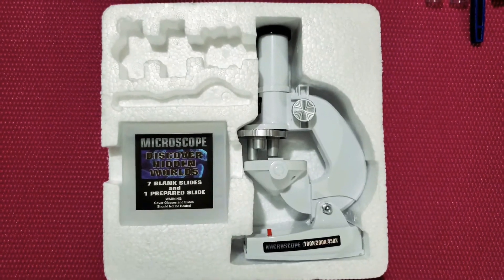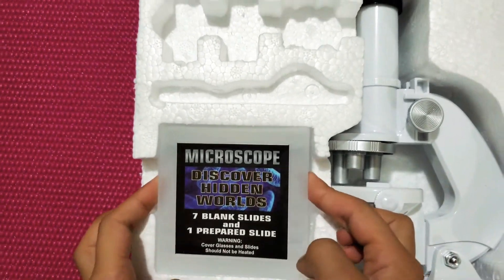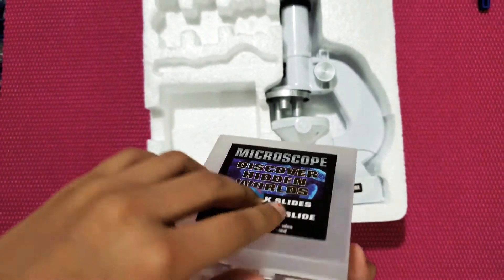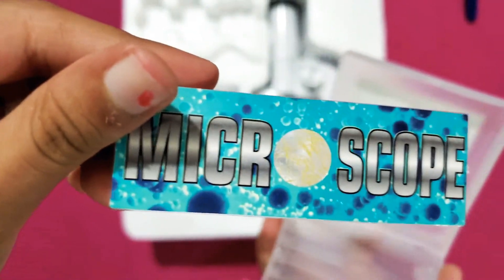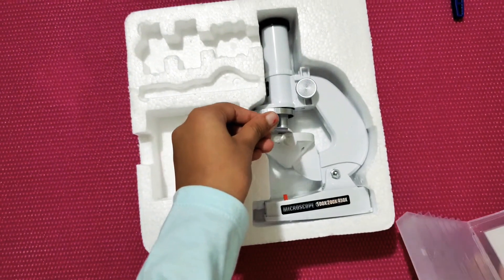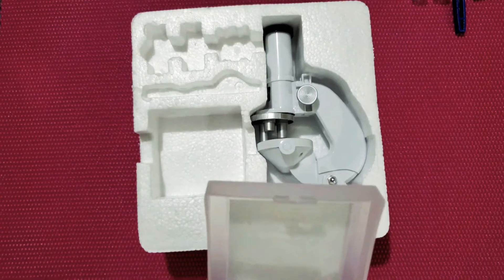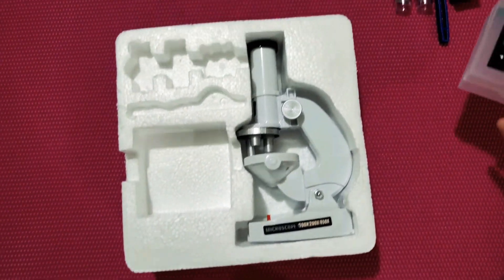Now let's take out the seven blank slides and one prepared slide. Here we have the slide container. Here is the prepared slide — it's for the microscope. You're supposed to put it in here so we can see what's inside. Let's put it back.